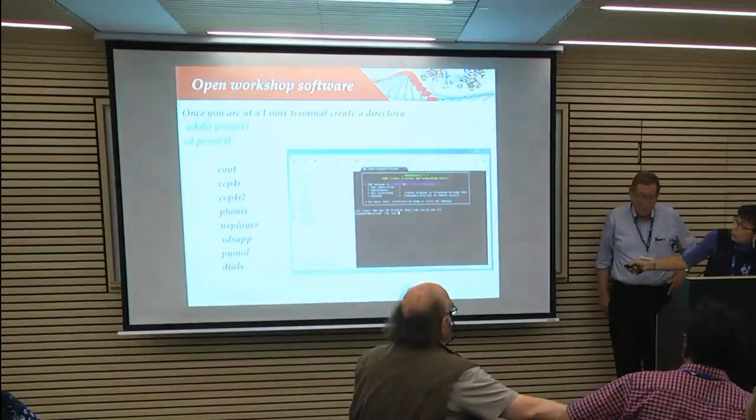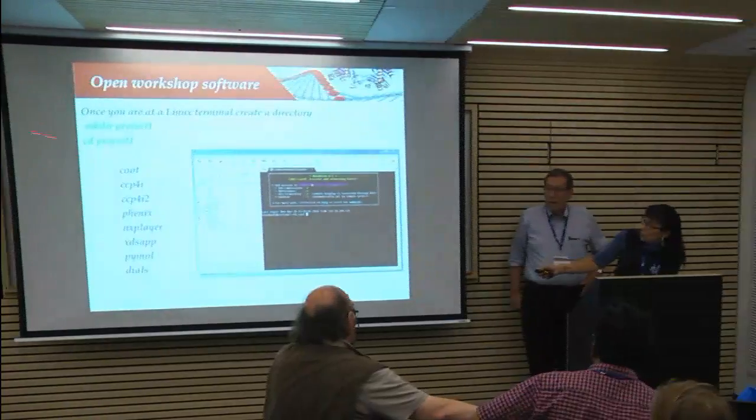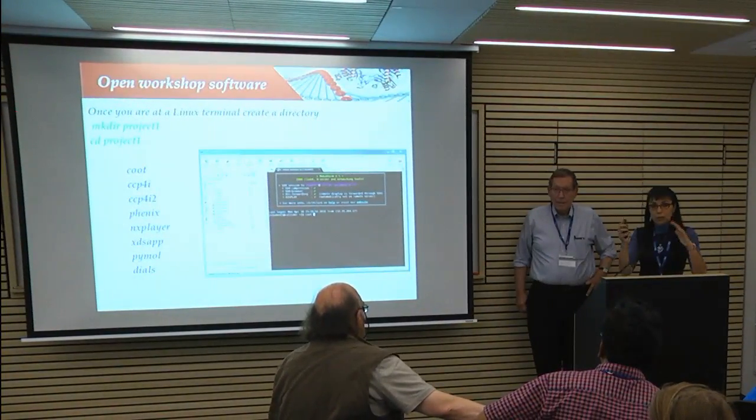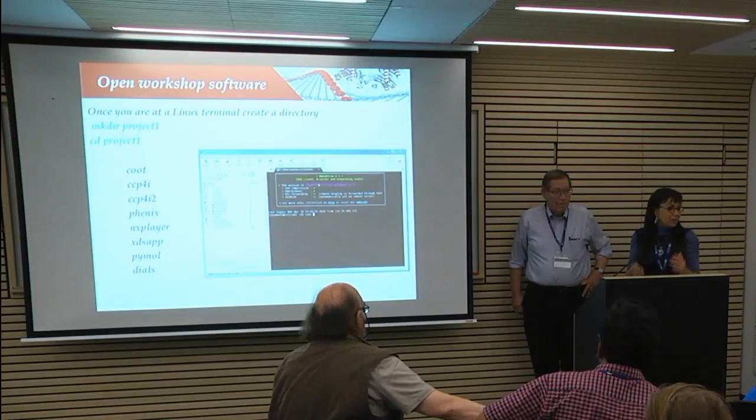Maybe it's good to mention that if you start processing with DIALS, for example, you do that as shown there, so that you start up these computations in a certain directory. Exactly. We would like you, if possible, once you get into the computer, to make a directory of your own project, and then whatever you run, have something which will show that it belongs to you and not to someone else. The next day you can find it.